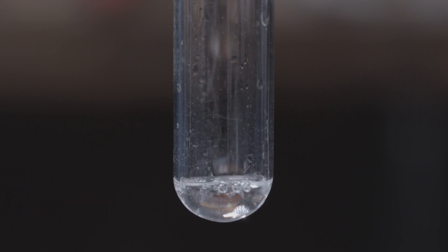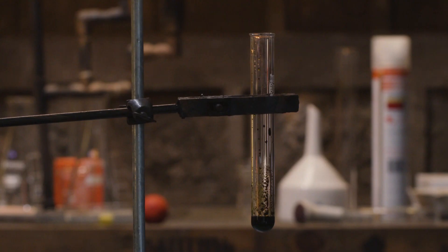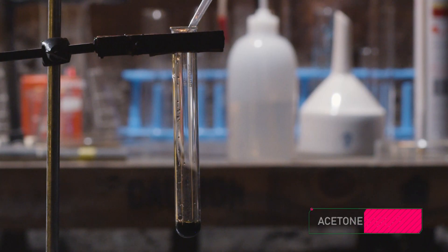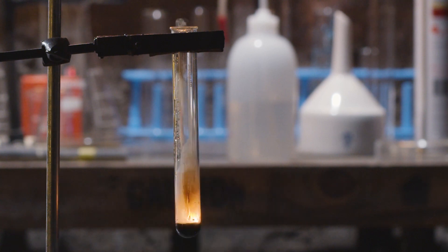Pour a bit of the same solution into a test tube and yeah, don't hold it if you want to keep your arms and eyes intact. Just put it on a stand like this. Now, from a distance, pour in a few drops of acetone or methanol and watch it burn and pop like a tiny rave.